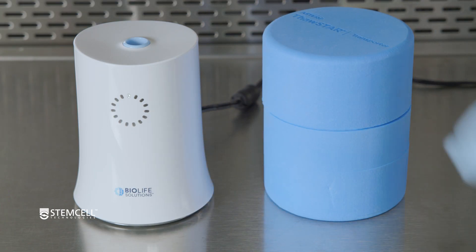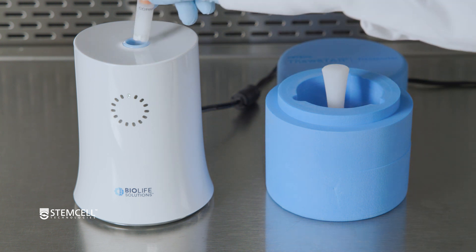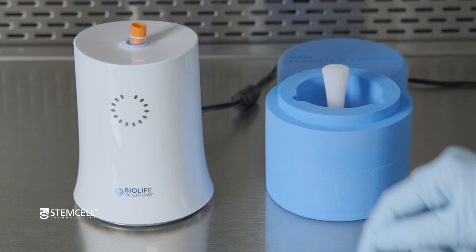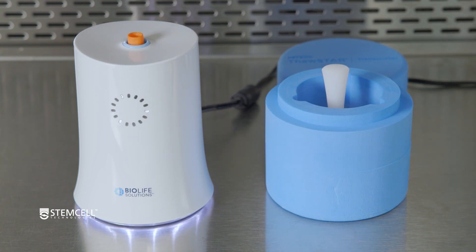Now it's time to thaw your frozen cells. Quickly remove your frozen cell vial from the CFT2 core and insert it into the opening on the top of the thawing system. Gently push the top of the vial down until a deep dual tone sounds.